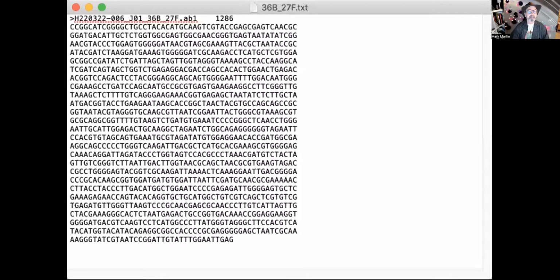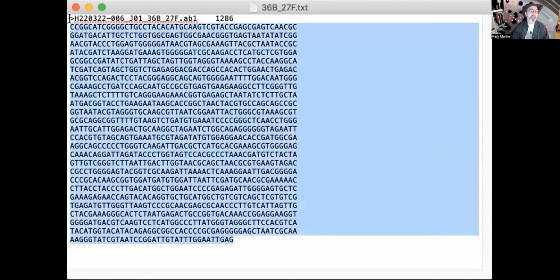Keep in mind that when you do that, what you have mostly is just material like this, where you have that text file. And with that text file, you can't tell if the data is good or bad. That's really the value of the chromatogram. So let's go ahead, as I showed you in lab, and let's copy. Oh, I had a student ask me, what if I had both of my chromatograms that are great? Well, that's wonderful for you. And that might be helpful to people in class who had situations that didn't work out.